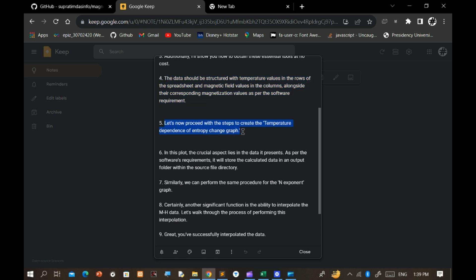Let's now proceed with the steps to create the temperature dependence of entropy change graph.